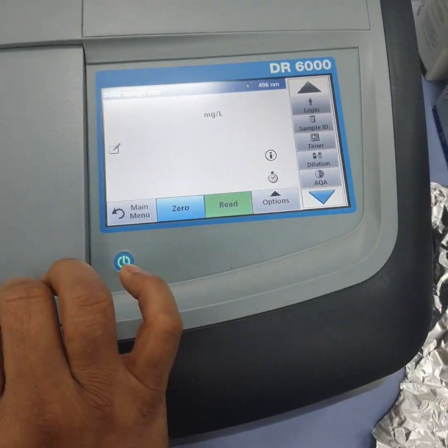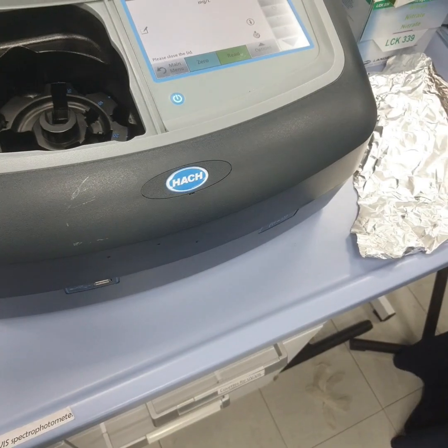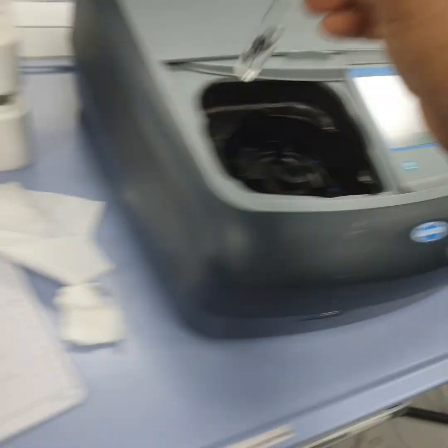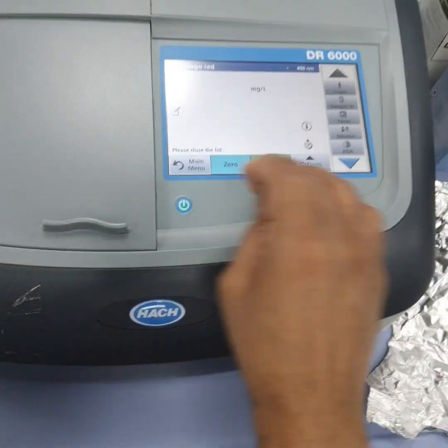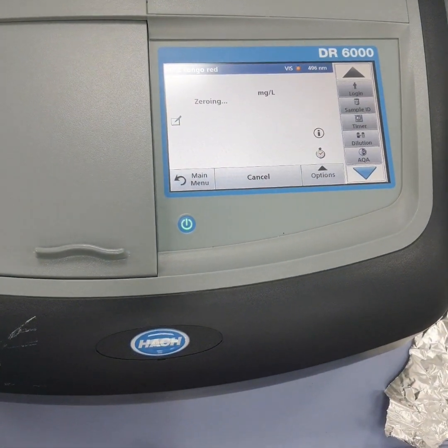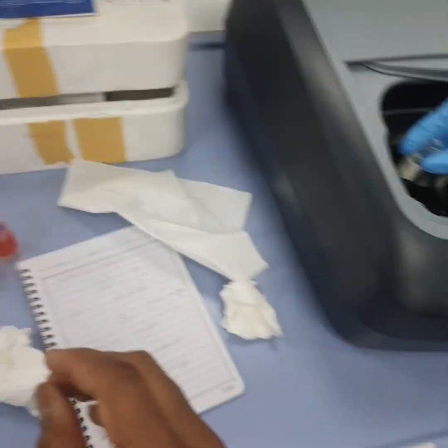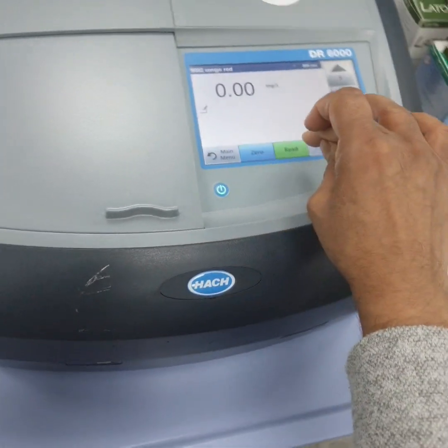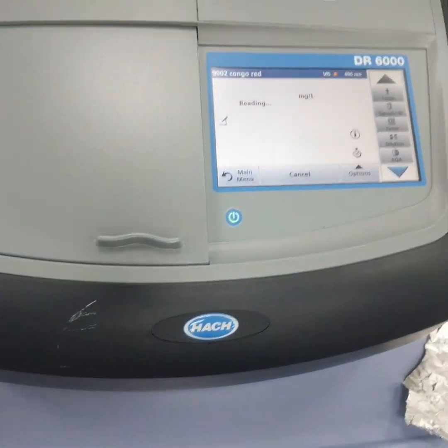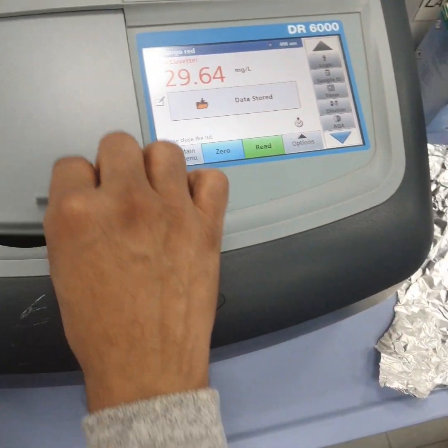So let's suppose this is 30. Hold this please in your hands. Don't throw it. Then try this one, 0. Okay, then check this one please. This is your unknown. And then read. So it's around 30, right?